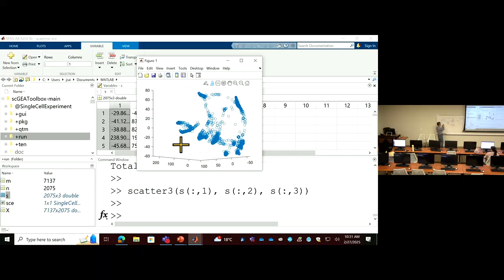If you do k-means directly from the original data, you rely on the estimation of a distance, and when the dimension is really high, you don't have a very good estimation using the original data. But if you use the distance between cells using this, because it has been processed already, it gives you better results in general.